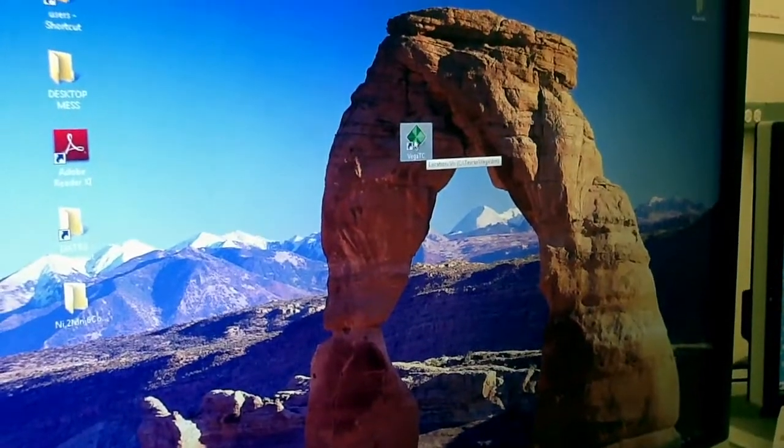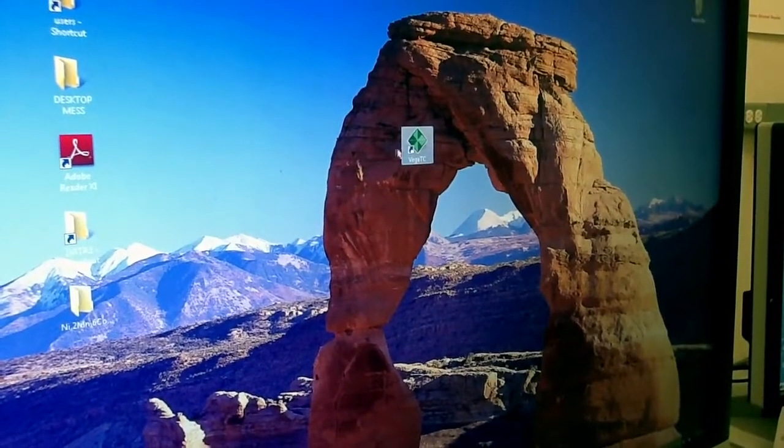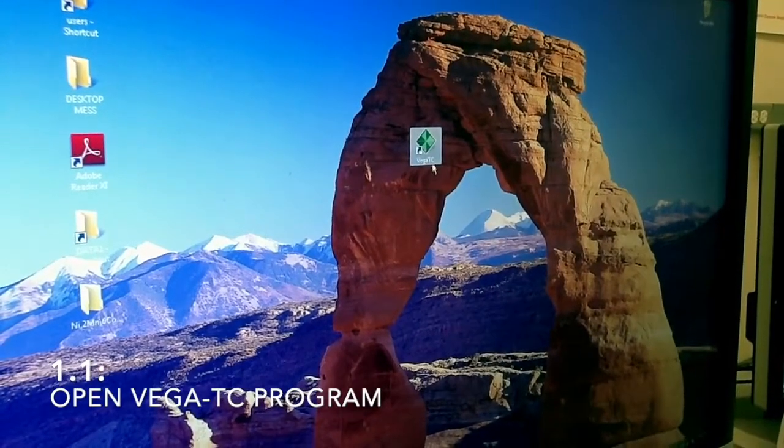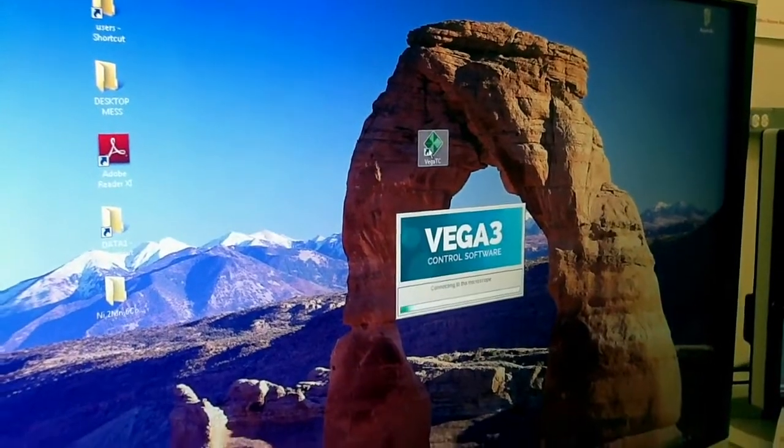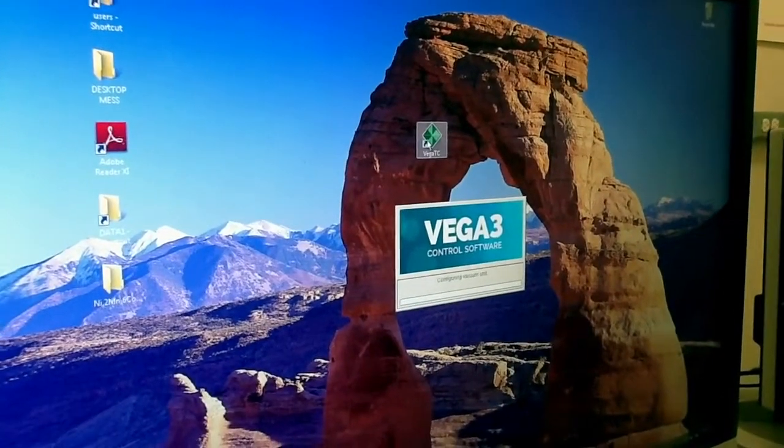Today I will show how to use our TESCAN VEGA3 SEM for just regular imaging. The first thing you want is to open the VegaTC software which controls the TESCAN SEM.